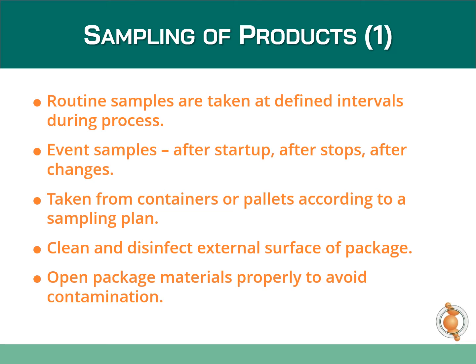Some samples can be taken from pallets according to the sampling plan. And the sample collector should always take caution to clean and disinfect the external surface of the package and open the packaging materials properly to avoid contamination.